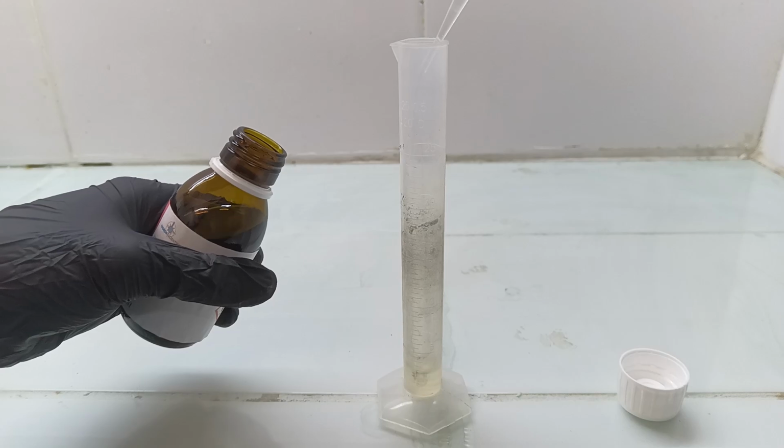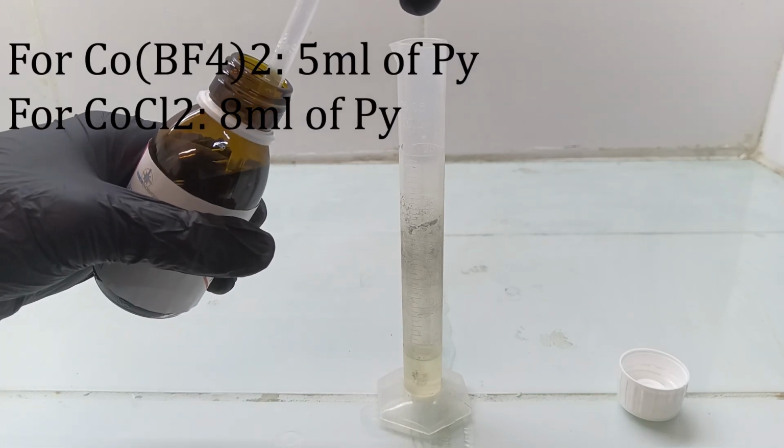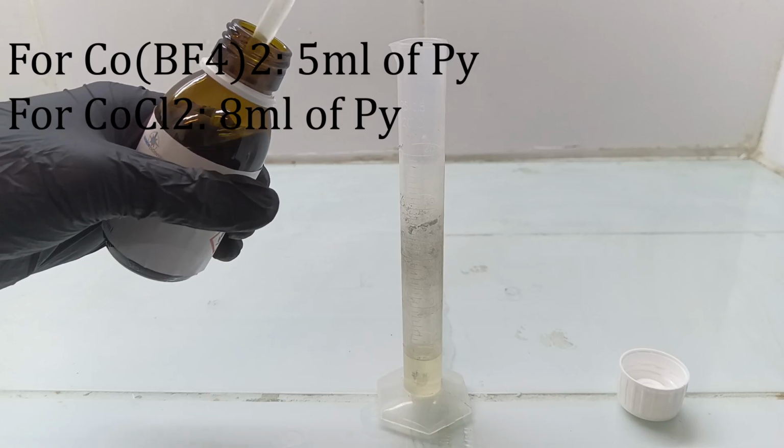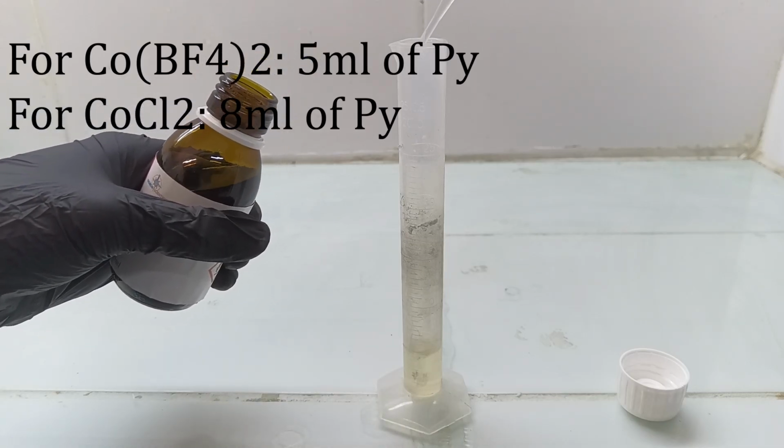We need to use ethanol for this very reason, as both of the complexes decompose in water, so an anhydrous solvent is needed. After that, I measured out the pyridine. For the tetrafluoroborate complex, I used 5 ml of it, and for the chloride complex, I used 8 ml.